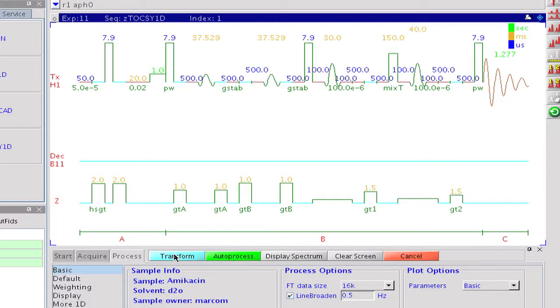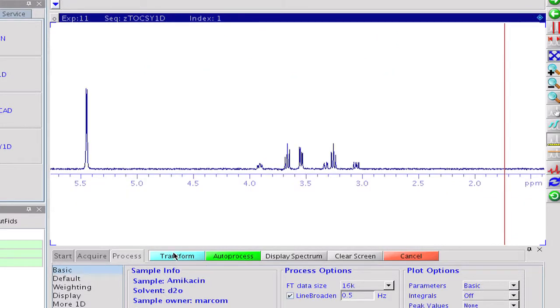We have now the sugar ring that has its anomeric proton at 5.5 ppm. The spectrum is clean. There is no crosstalk from other spin systems.